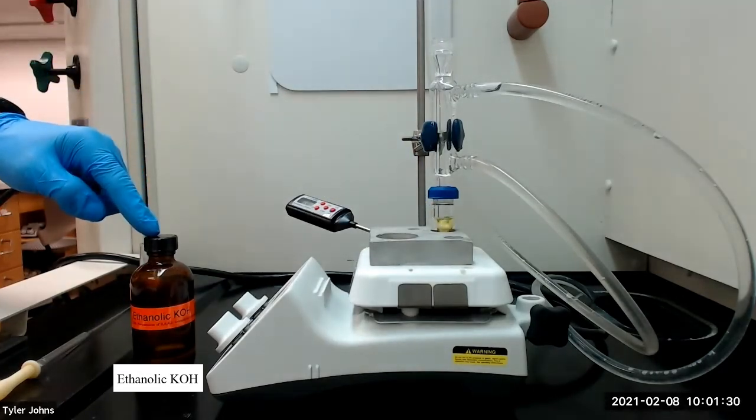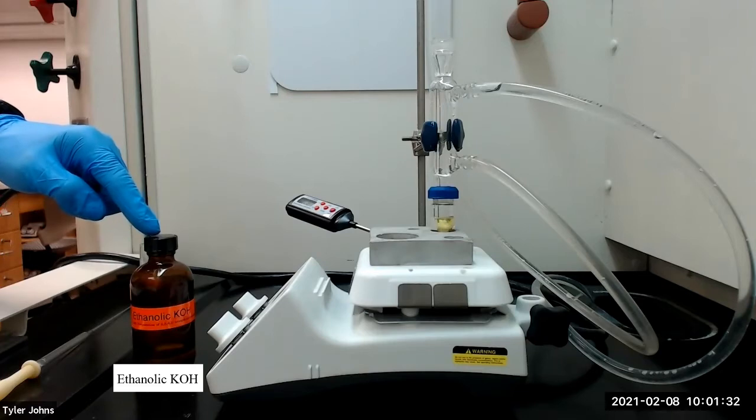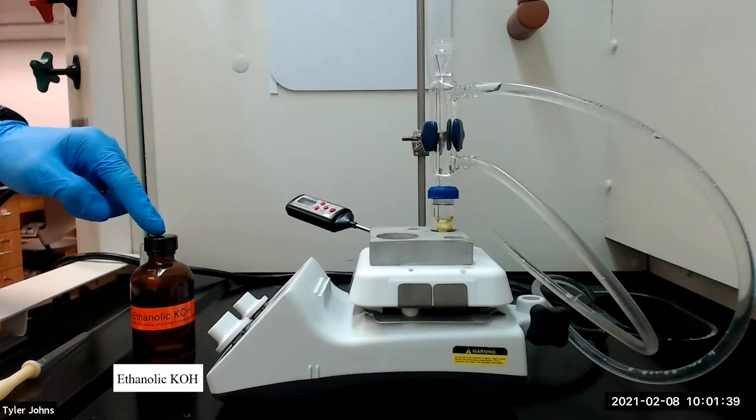The ethanolic potassium hydroxide solution is made from dissolving 0.4 grams of potassium hydroxide in 4 milliliters of absolute ethanol.